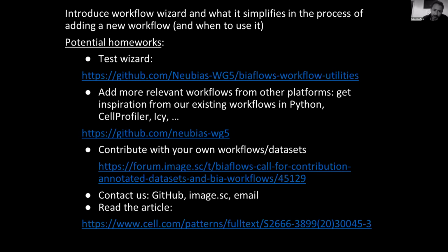Finally, BIAFLOWS is published in Patterns, a new journal from Cell Press. So you can have a look. It's going into some details. Most of them we already covered, but you can read the article as well. And in the article, you also have a detailed manual on how to contribute datasets. So the information is a bit redundant with the forum, but still, it's there.